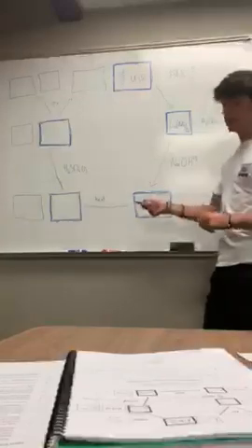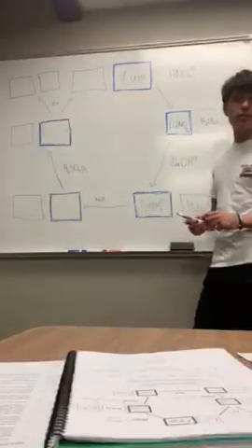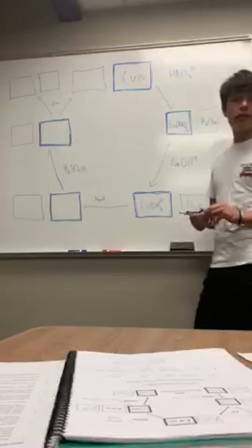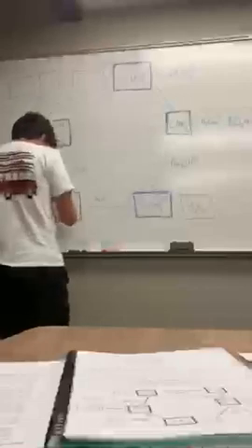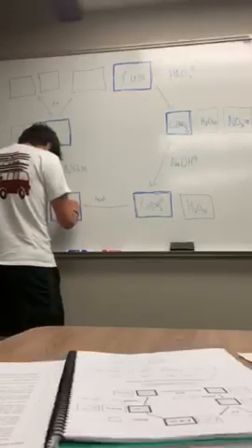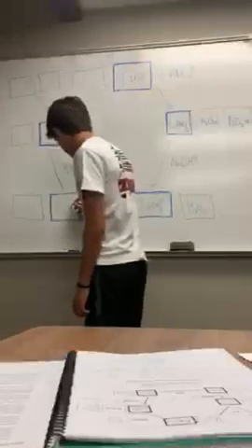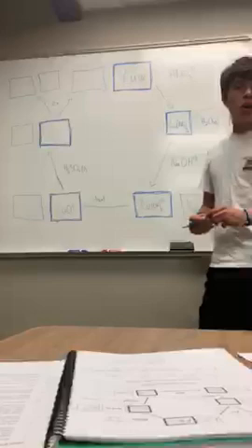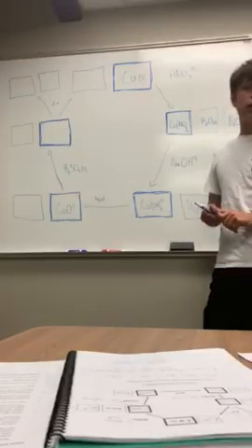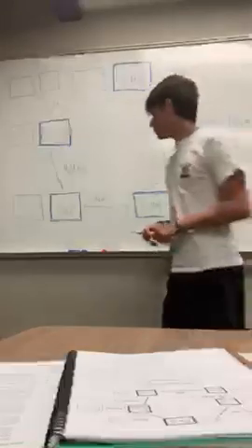The solution was then heated up and a black substance started to form. The black substance, copper oxide, which was a solid, eventually settled to the bottom, and water was the liquid that stayed at the top.